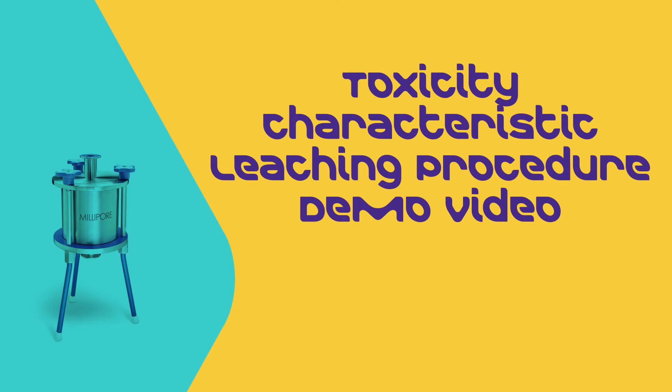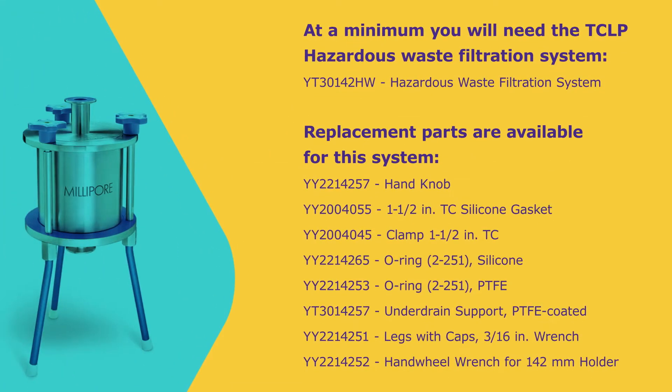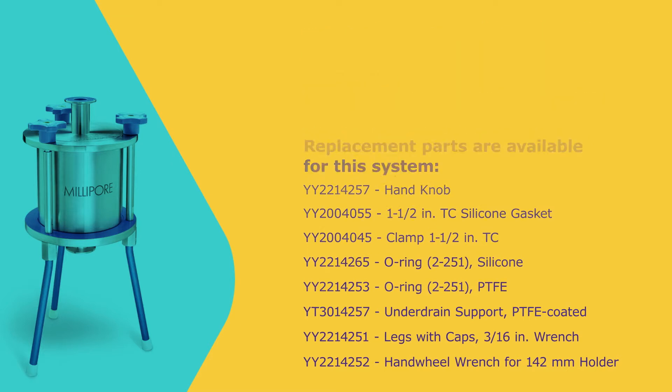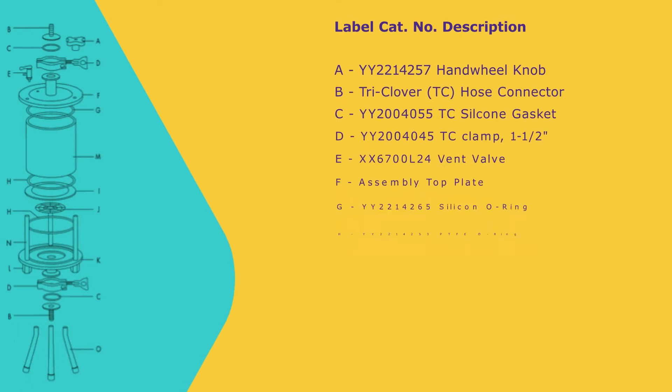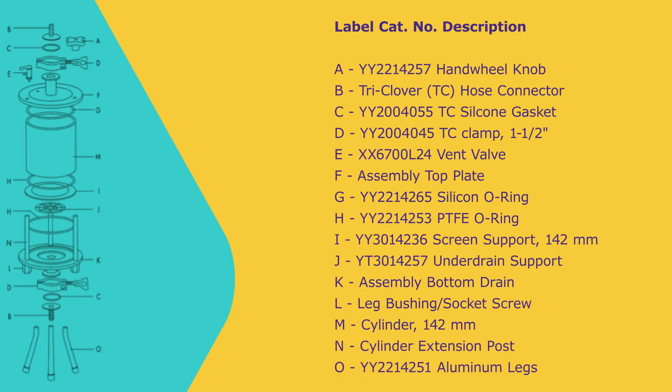In this video we will describe soil sample testing using the TCLP hazardous waste filtration system. At a minimum you will need the TCLP hazardous waste filtration system; replacement parts are available for this system. You will also need the following accessories. We have labeled the components of the TCLP system for quick reference based on the table below.